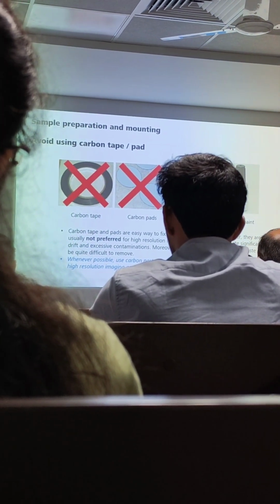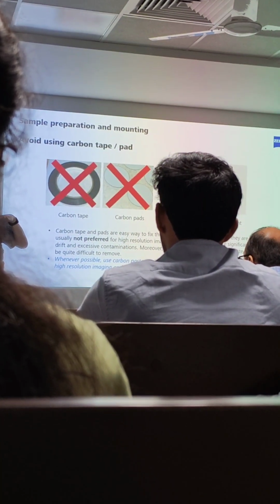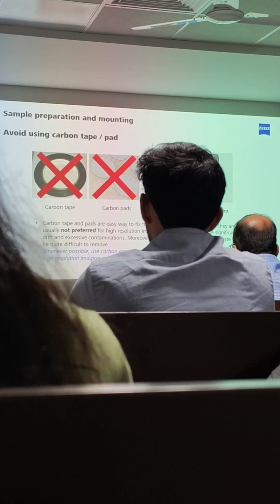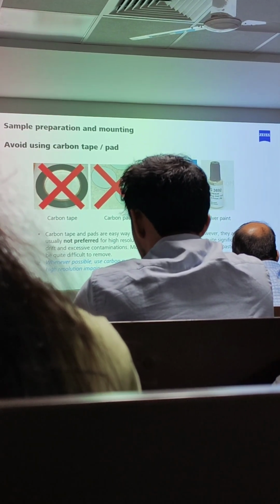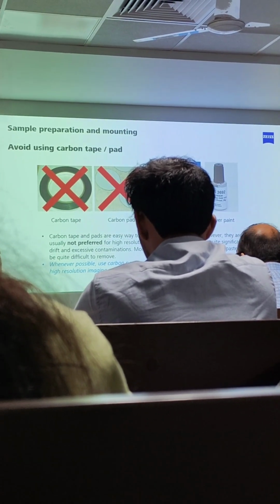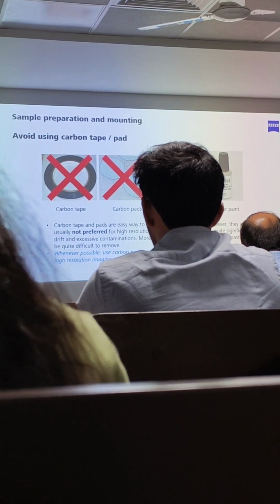Yeah, we don't recommend a carbon tape or carbon pads because they will give out a lot of carbon. When you do your EDX, you will know that there's a lot of information coming out that was not your sample. If you know, it's good. If you don't know, then you write the paper and say, oh, I saw a lot, then it's totally wrong, right? Yes. I'm an active reviewer myself, so when I see all this description, I know they are not experts in that. They just anyhow write, anyhow analyze the data.